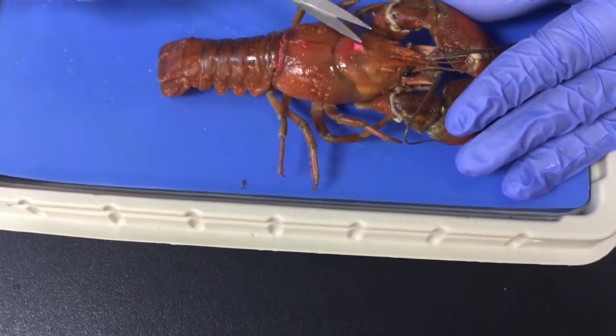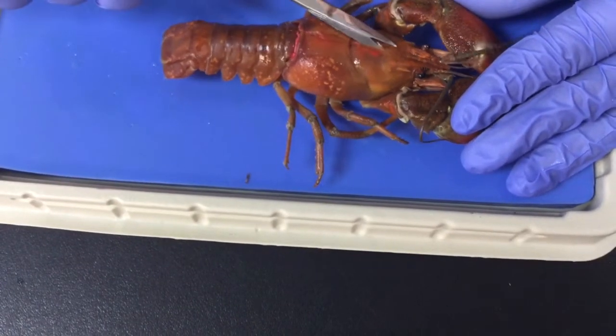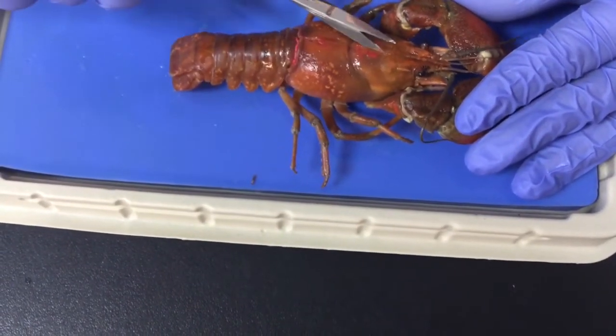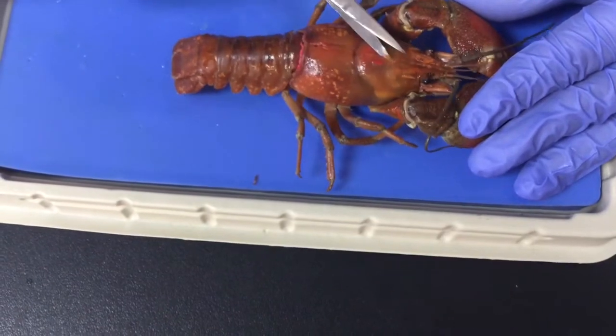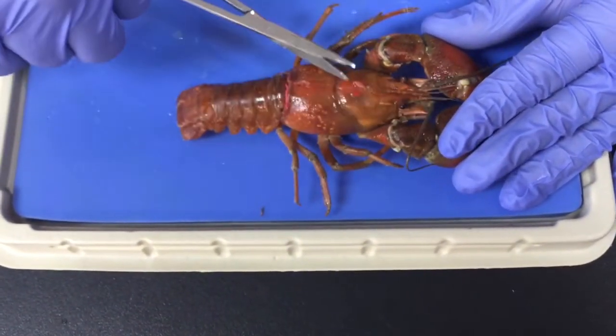Oh, a little too deep, Ethan. Keep going. I think I just got his brain. No, that was a blood vessel. That's okay. Keep going. Stay superficial. It's very thin. Keep going. You're almost there. I'm going to fast forward this.